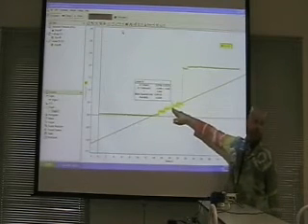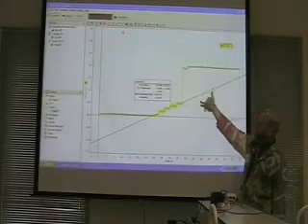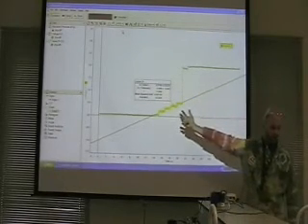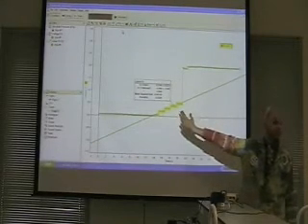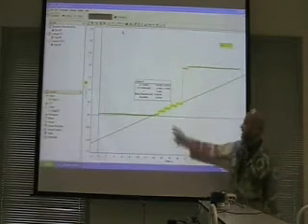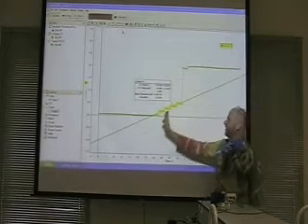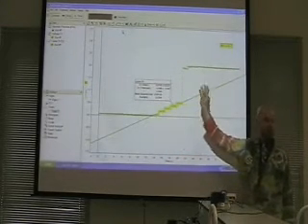And you get this, you get the stair step thing going on with the voltmeter. But according to the Beer-Lambert law, absorbance increases linearly with concentration, so therefore the voltage should increase linearly with concentration as well. So that's the reason I tried a linear fit, and if you kind of get over the idea that you've got these stair steps, pretty good.